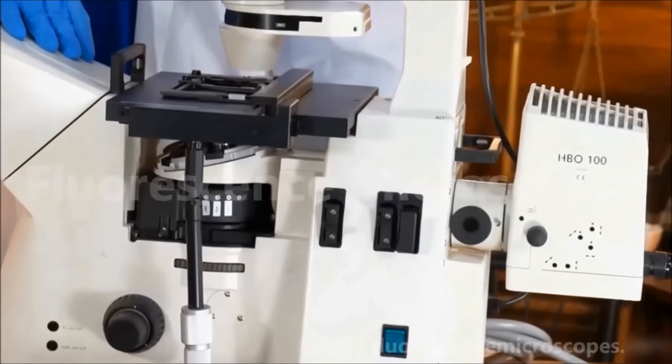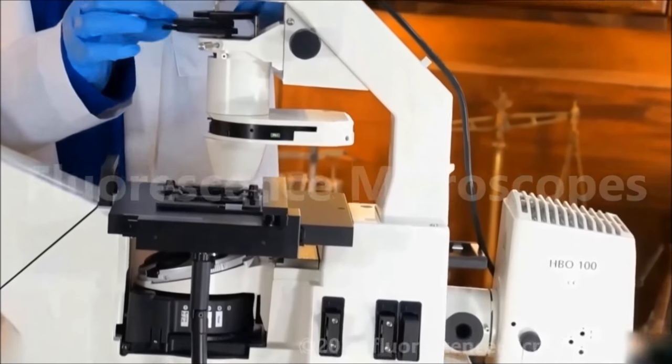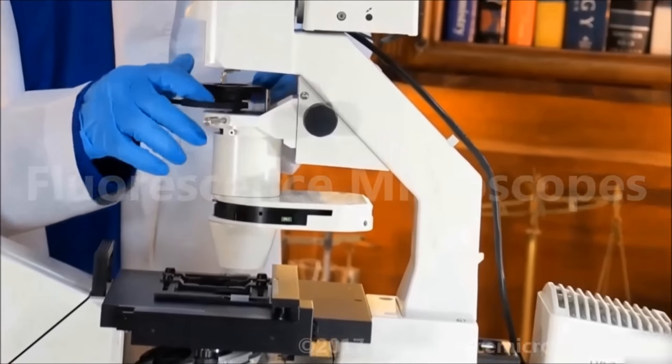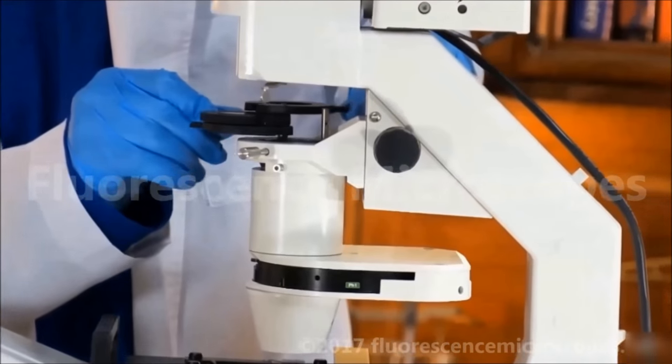We've got a variety of filters, filter holders for the upper transmitted. We're including two different filters.